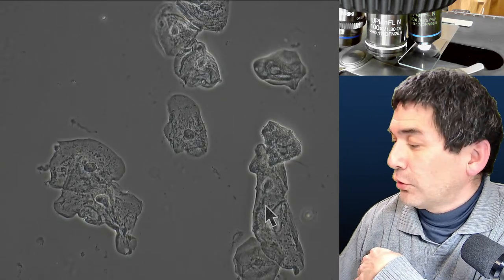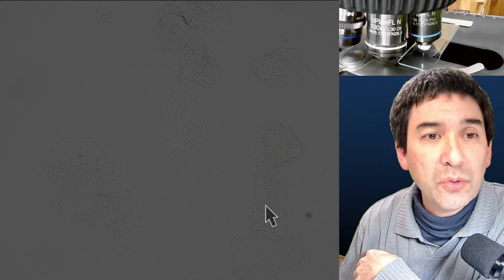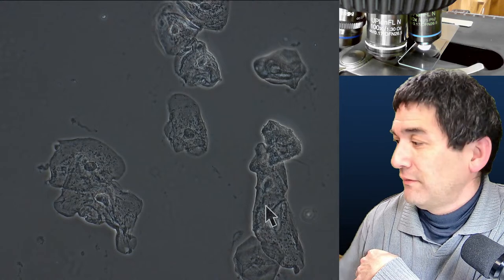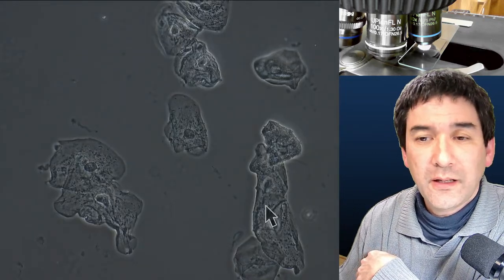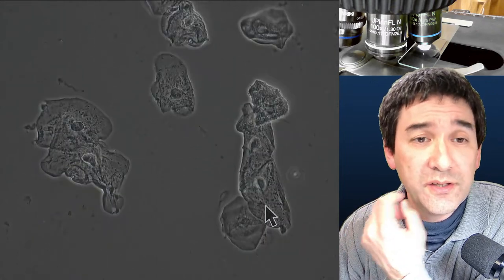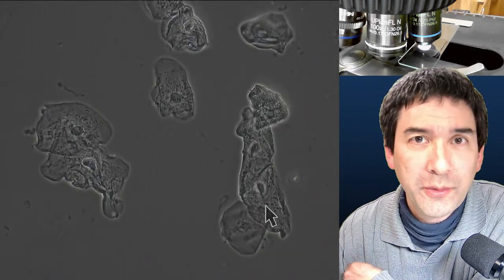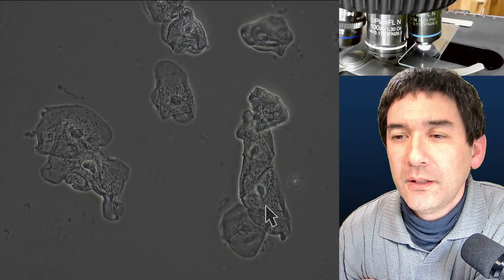For comparison — here is bright field, very difficult to see — and here is phase contrast. Big difference. The cells appear dark on a bright background. These cells shed naturally from the inside of my mouth all the time; normally we just swallow them and they're digested.